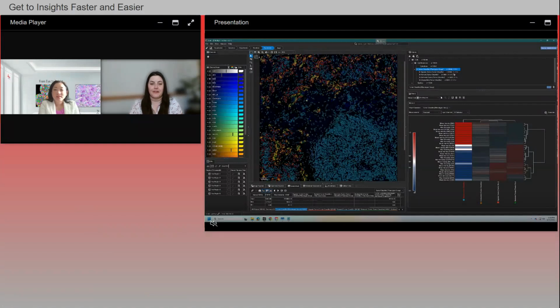Wonderful, thank you. All right, keep the questions coming in. I see them flooding in, so this is wonderful. Our next question for you asks, can you differentiate between cells that cluster together versus ones that don't? So more empty space in the former, there's no other difference in phenotype or markers.